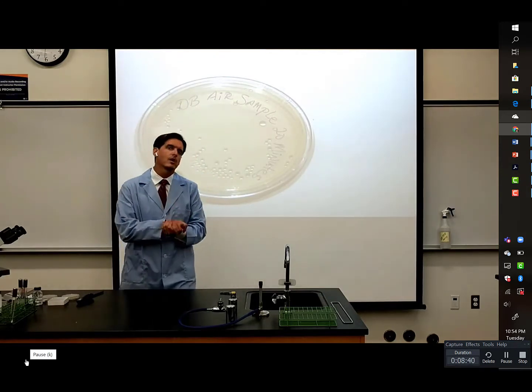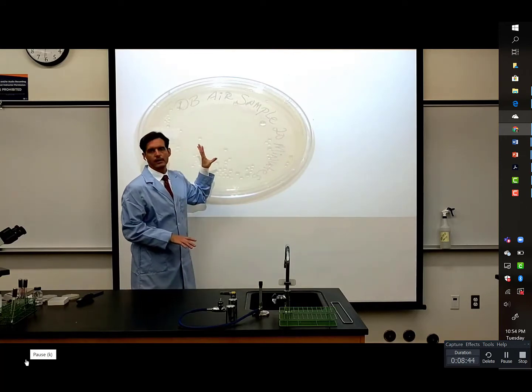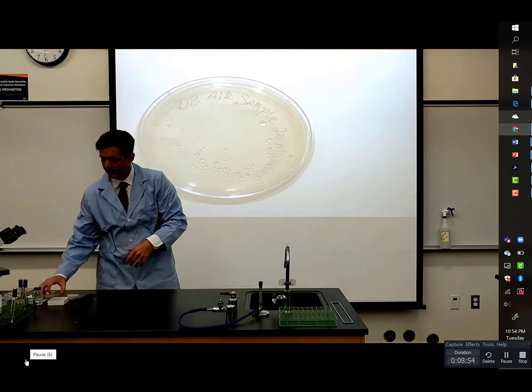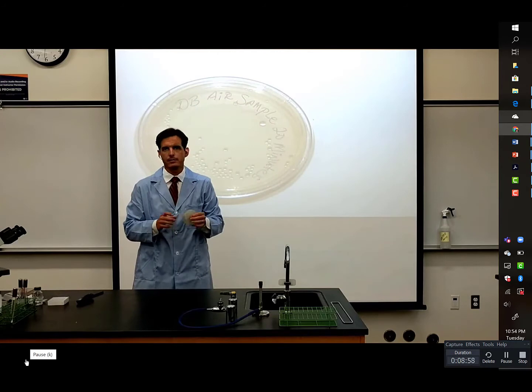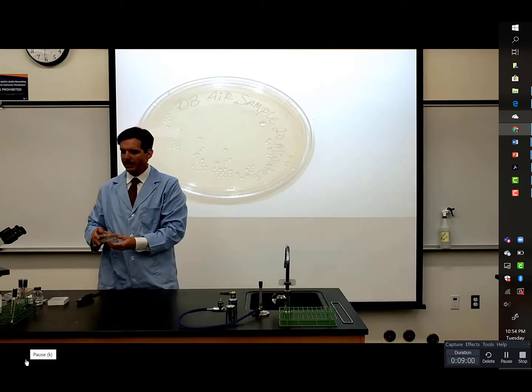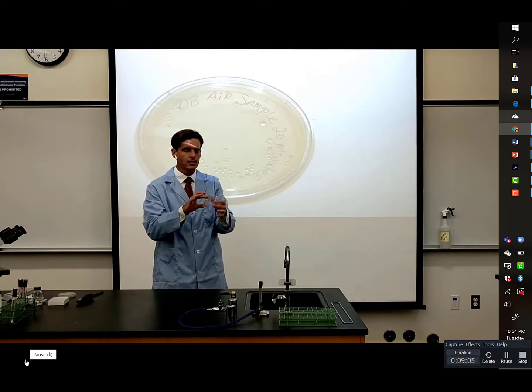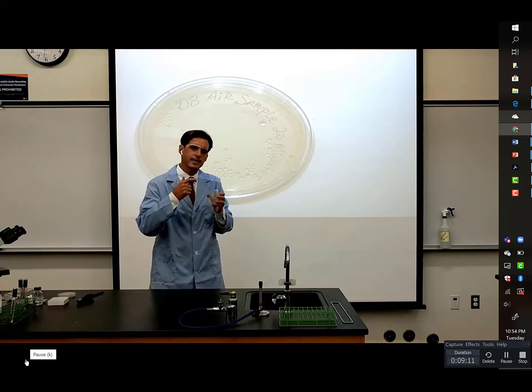And if there's one more thing that we can keep in mind here, it's, what if we had an accident? What if you had a stack of plates and they fell off the counter or something like that? If these plates come apart and you had an accident, if you have the label on the bottom, that's where the bacteria are growing on the actual food source.